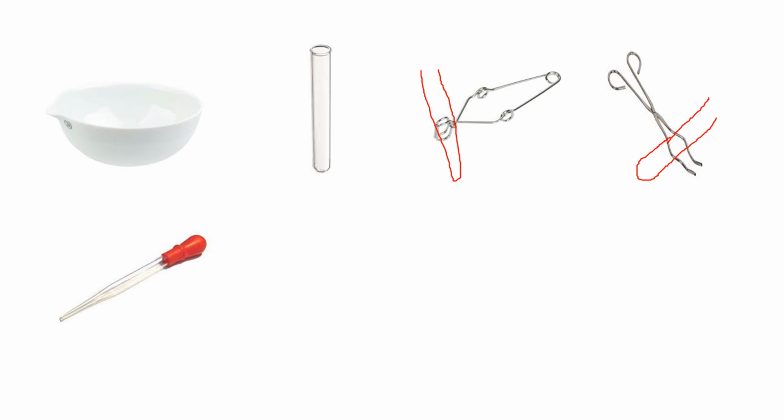This is called a dropper, or sometimes we call it a small pipette. If you want to add a small amount of liquid, you squeeze from this end and dip it into the liquid, then release. A vacuum is created, so you will take some liquid inside.